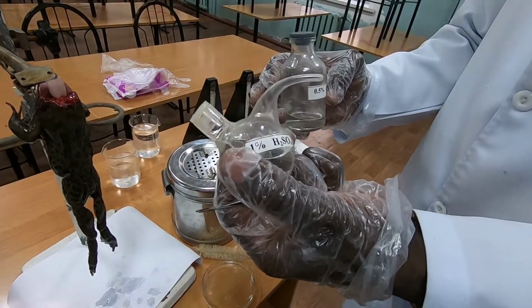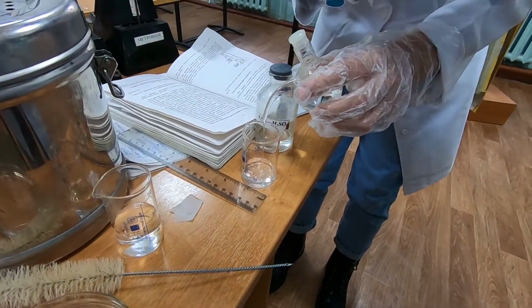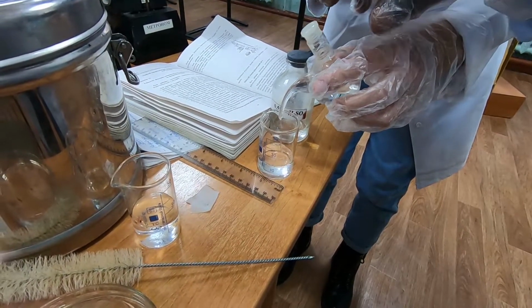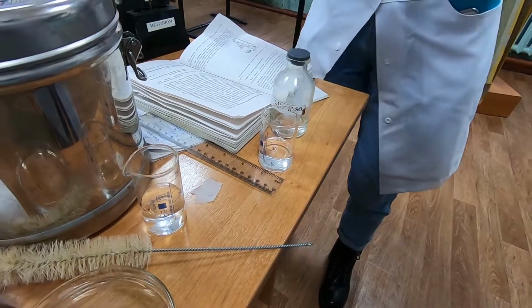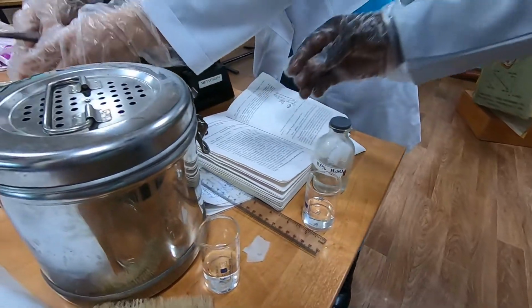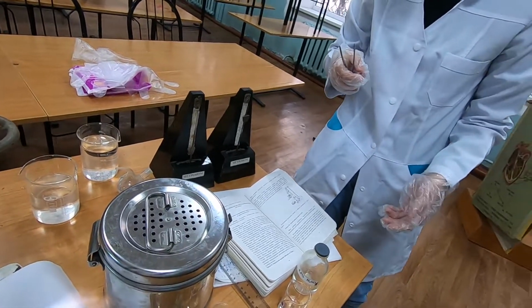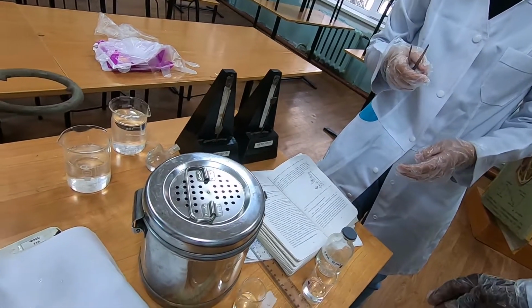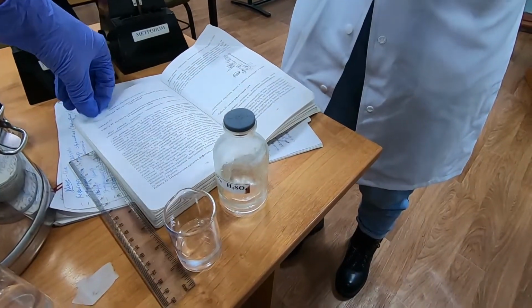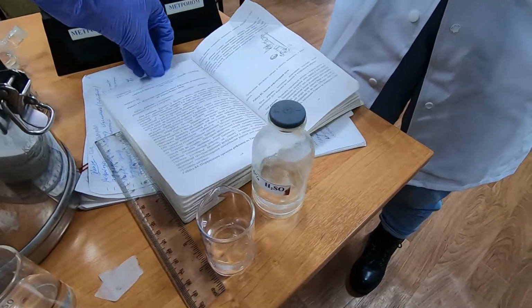So you're going to see now. We are taking some volume of 1% sulfuric acid. 1% is not all that dangerous, but be careful with acids.